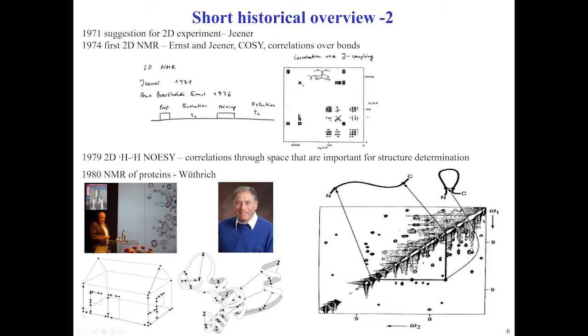I don't know about you, the audience, but it works a little bit like taking a meter and measuring a certain object, like distances from a corner. You have height, length, a little bit of inclination, the position of wind and sun, and from a few of these distances, perhaps a few tens, you'll have quite a good model of a given object, a house here, right? If you go into the biomolecular world, of course, you will have interatomic distances that help to fit in space.